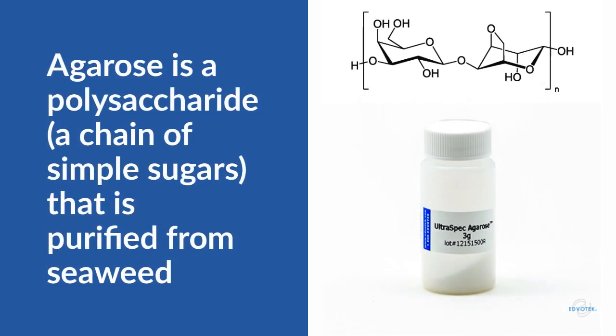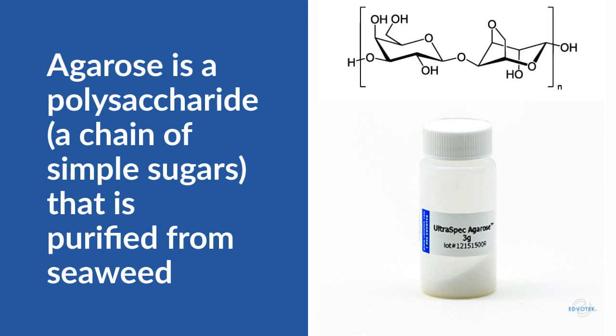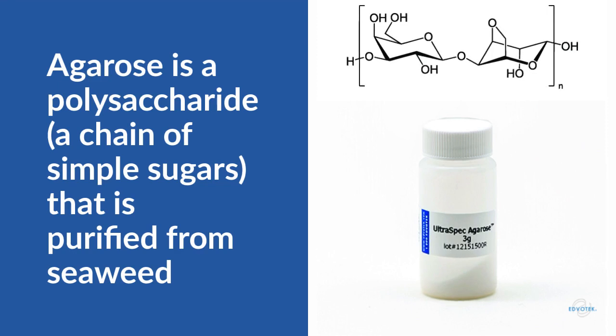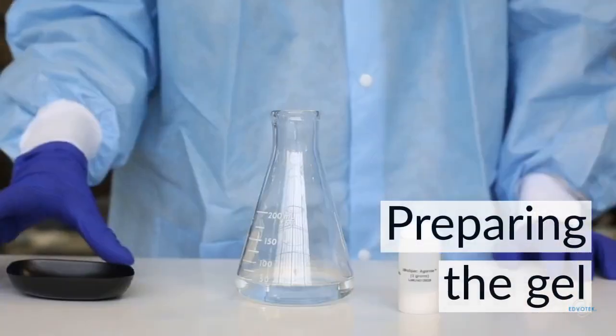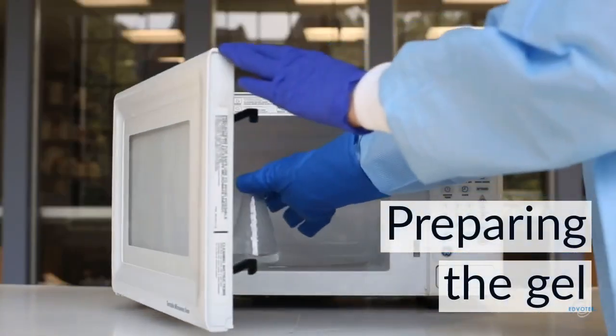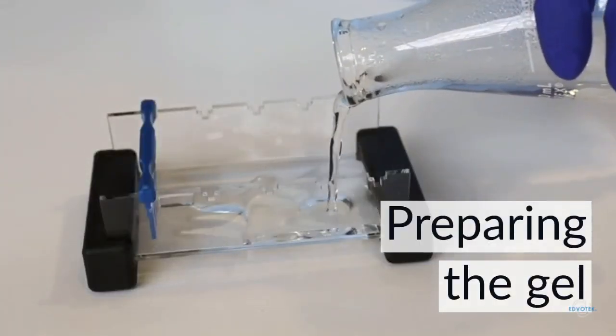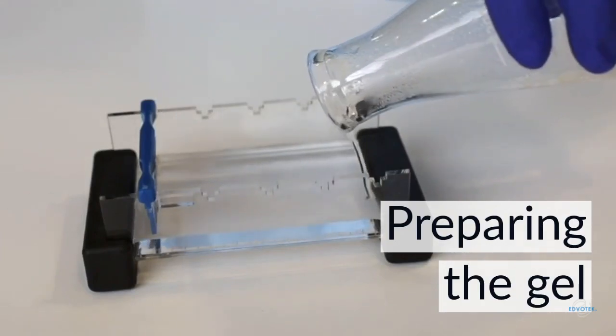One step that's easy to overlook is the preparation of the agarose gel. Agarose is a long chain of simple sugar molecules, or polysaccharide, which is purified from seaweed. When prepared correctly, the agarose acts like a strainer or sieve, helping us to separate molecules by size. In our kits, we send agarose as a white powder in a small plastic vial, pre-measured with the mass noted on the label. To make our gel, we measure out the correct mass of agarose powder, add it to the electrophoresis buffer, and dissolve it by boiling. The melted agarose is poured into a mold and allowed to cool. For most of our ready-to-load experiments, we recommend a 0.8% gel.